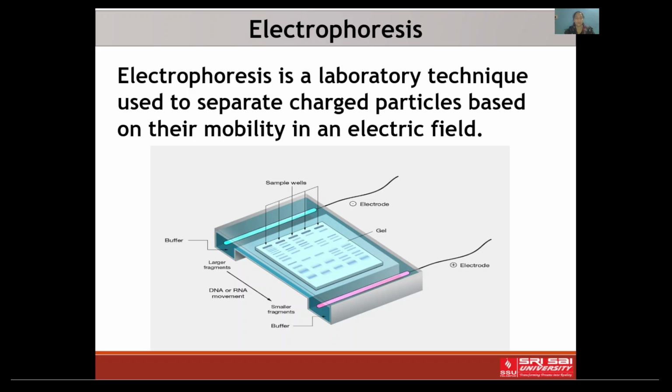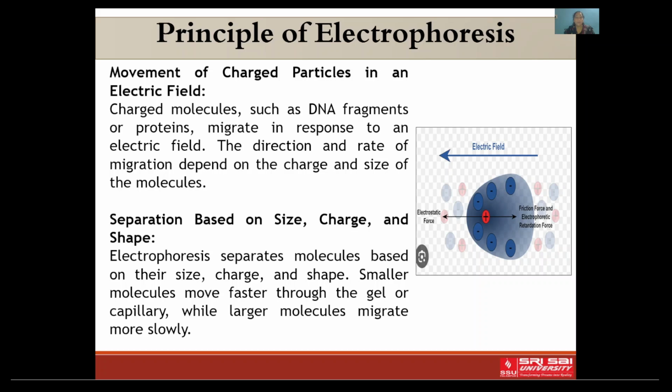Electrophoresis is a laboratory technique used to separate charged particles based on their mobility in an electric field. It is a critical method for analyzing the components of complex mixtures, whether you are working with nucleic acids or proteins. Principle of electrophoresis.